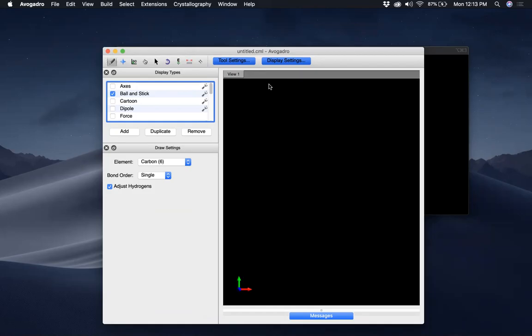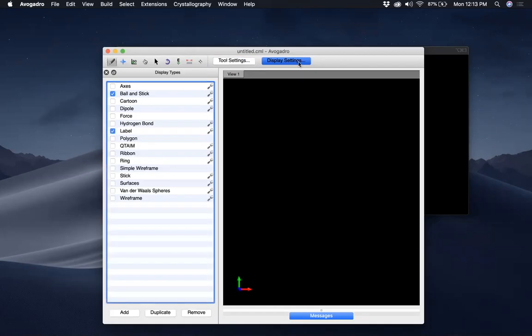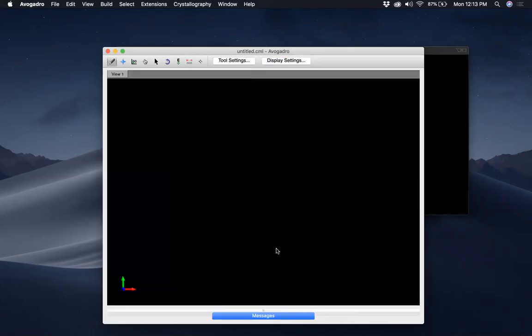I think when you first download, install, and open Avogadro you will probably see a screen like this. I'll give you a tour of the tools here. If you notice, I just need to take my cursor there and place it and it shows the tool name.